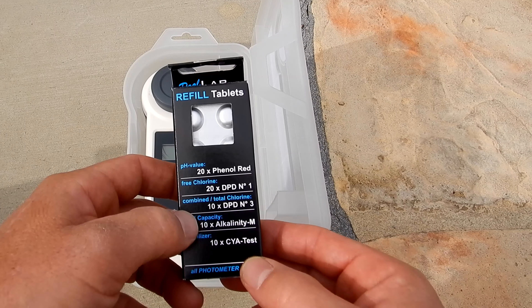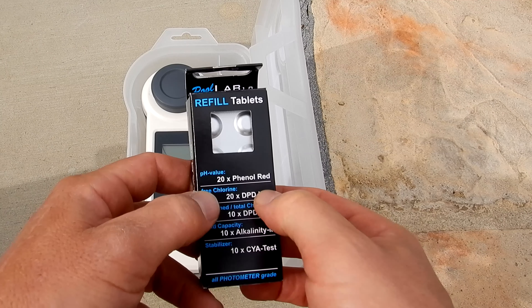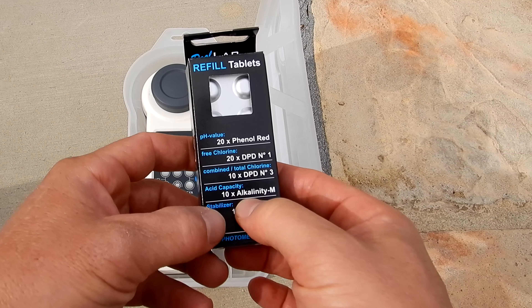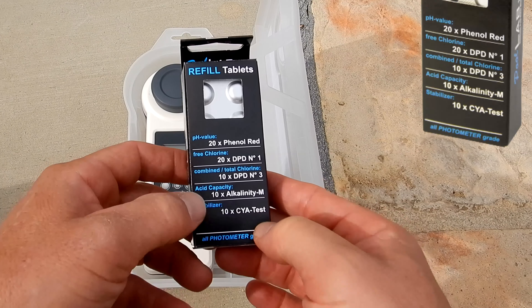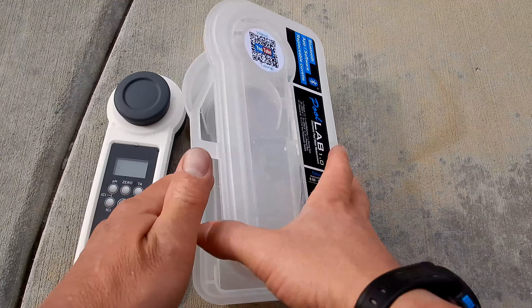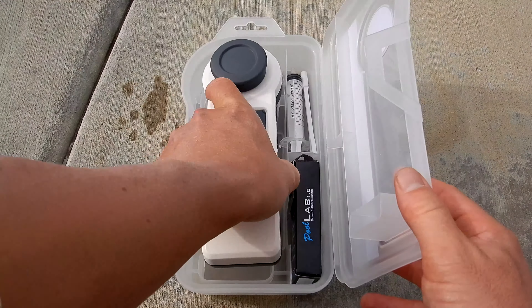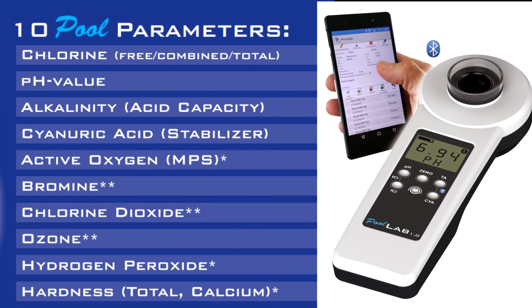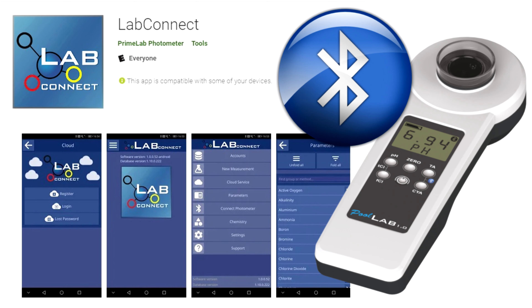Included with the PoolLab 1.0 are some tablets: 20 phenol red, 20 DPD1, 10 DPD3, 10 alkalinity, and 10 cyanuric acid tests. You can order refill tabs and also tablets for the other tests. You can see how easy and accurate using the PoolLab 1.0 is for your water testing. It does a variety of parameters for your pool and spa water. You can also send the results over to your phone or device using the LabConnect app and store them there, making the PoolLab 1.0 one of the most versatile photometer water testers on the market today.